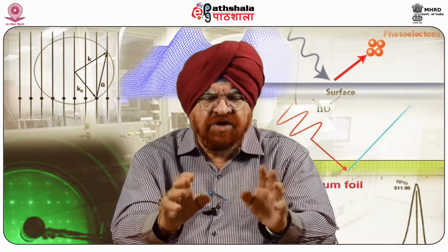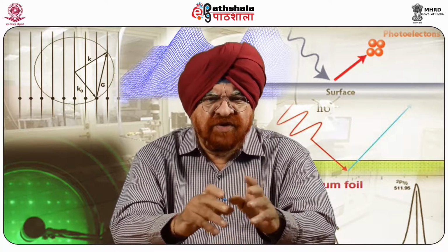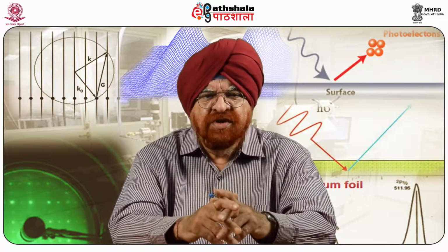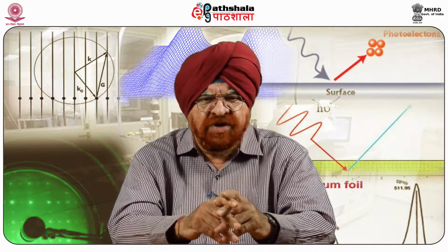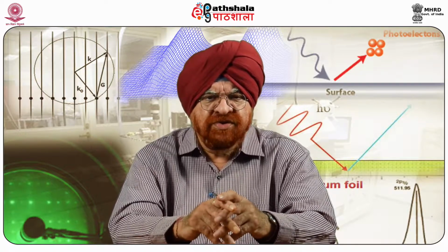There are many disadvantages when we use this technique. There are some shortcomings or limitations or difficulties when working with an AFM with magnetic force microscopy, such as the recorded image depends upon the type of the tip and magnetic coating, due to the tip-sample interactions.